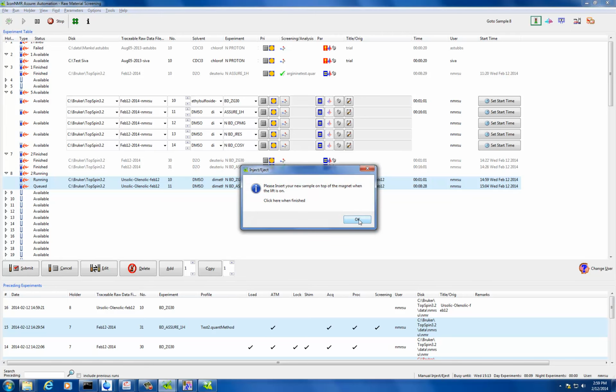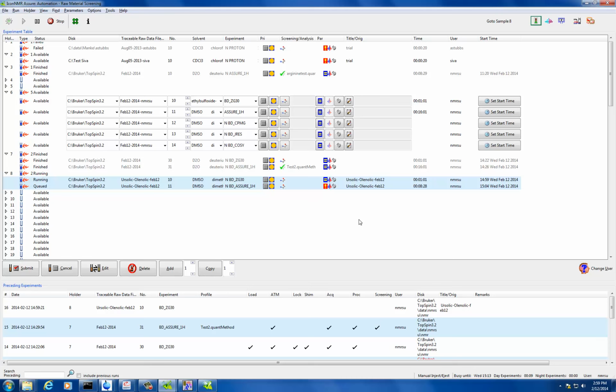Hopefully later you guys will get an auto sampler. I hope we do. That would really help. Since the students have access to changing scans and pulse and stuff like that, if one person changes the pulse, does that affect others? It's only for that experiment. Oh, all right. They're not screwing it up for everybody. Yeah. They would have to go to TopSpin and actually save and overwrite. If they go that far, then I'm like, okay.